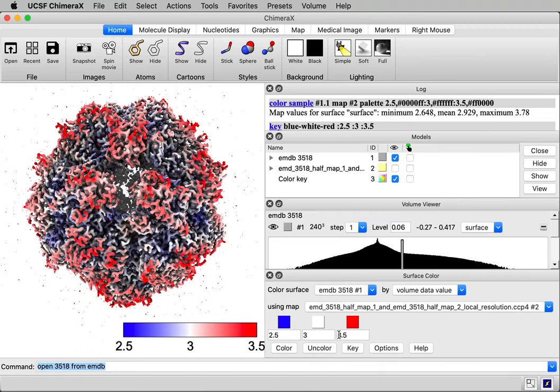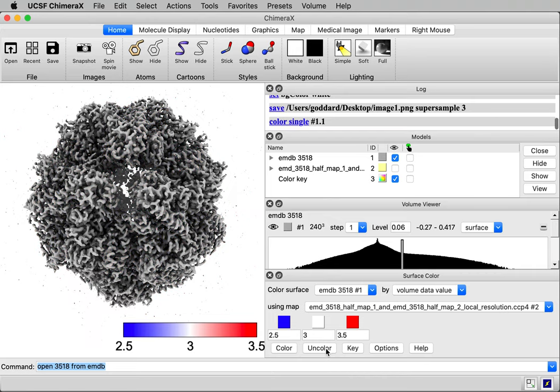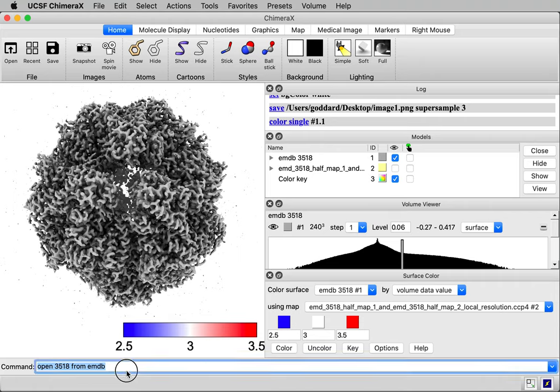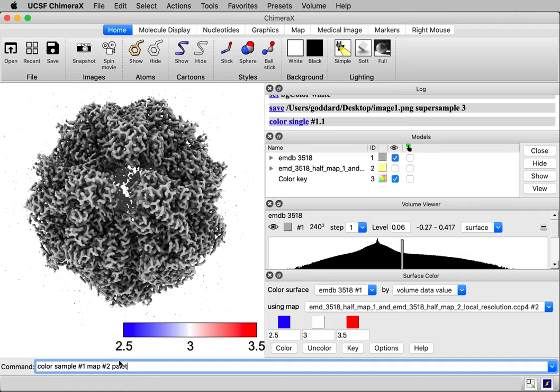First, I'm going to go to the Surface Color dialog and press the uncolor button, so we'll start with no coloring. And then the command is color sample number one. Number one is the ID of my map, using map number two, the local resolution map.